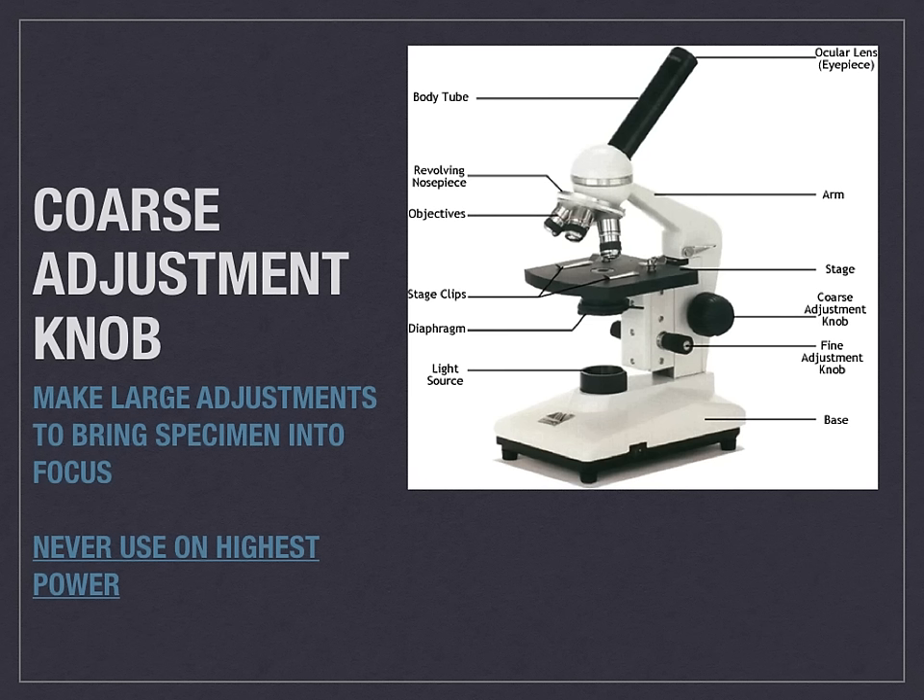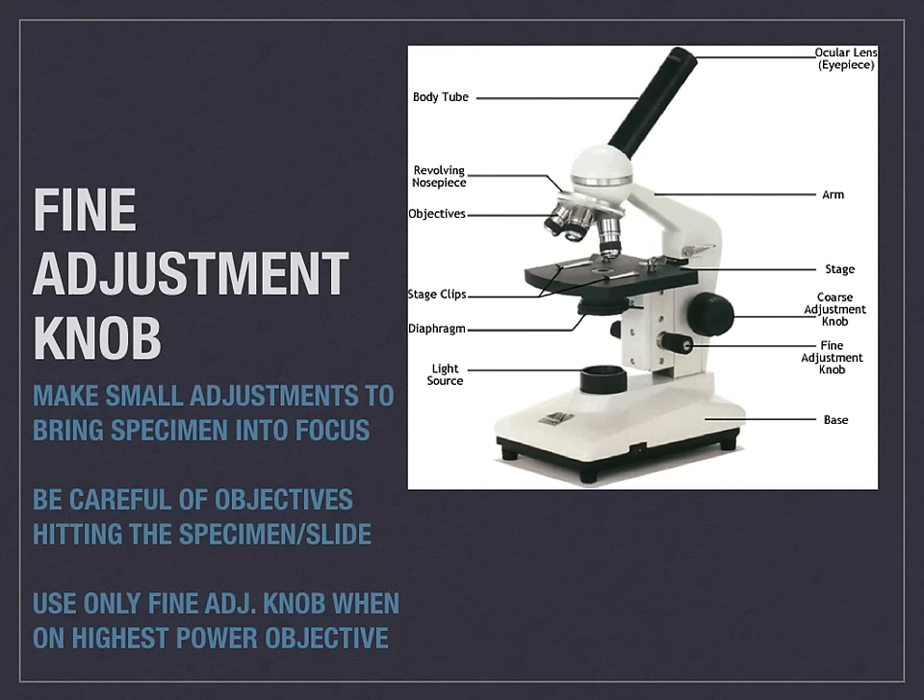You use this to initially bring the specimen into focus. When doing so, make sure you are never on the highest power. You will use this knob first, followed by the fine adjustment knob.